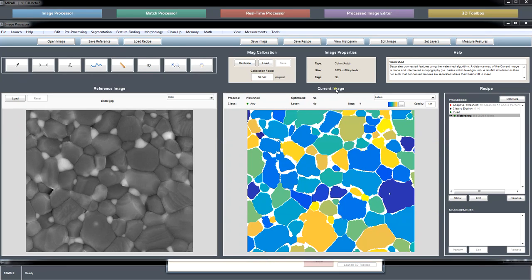Yes, Meg, so 1500 by 1000 is a pretty small image. We have definitely worked with 10K by 3500. That is going to be slow, but we have worked with it. I guess it's really going to depend on the hardware configuration, and the only way to know is to test it out. MIPAR will open it, and you can certainly process it, but it's obviously going to be slower than 1500 by 1000. So the only real solution is to try it out on your hardware and see how it goes.